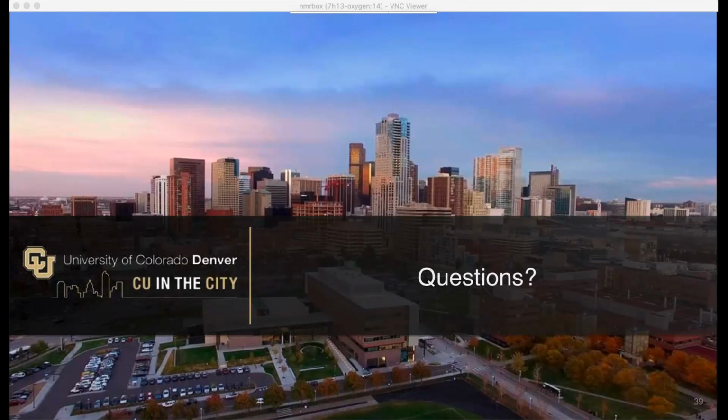Well, I don't have any problem with Catalina. We recompiled everything for Catalina, so you can just download it. If you want to run locally, you can download the Mac version from the NMRFAM software download page, and it will work the same. Actually, I'm using Catalina, and there is no problem. But if you use NMRbox, you don't really need to care about those kinds of problems. I would say that will make Adam happy.